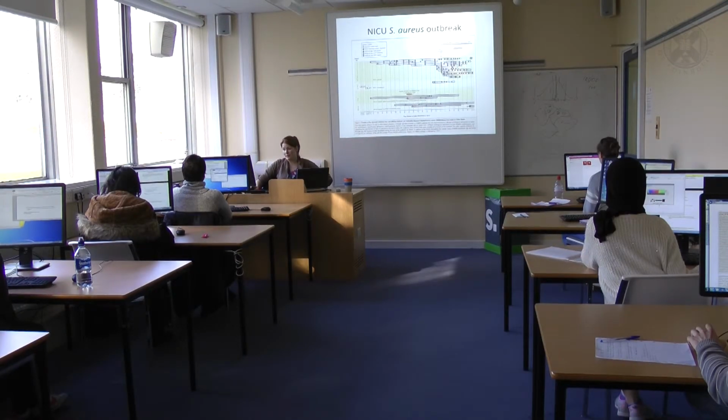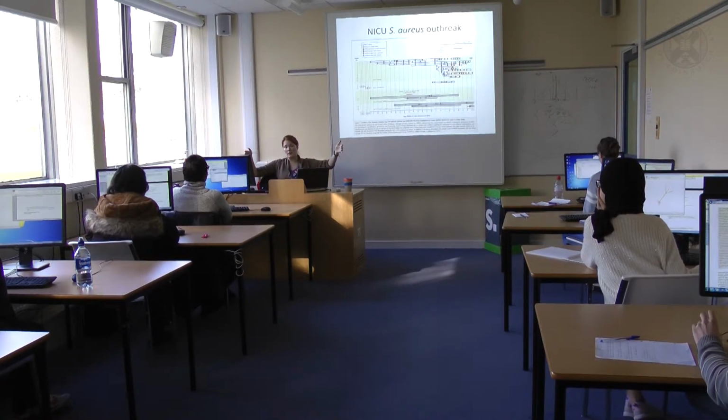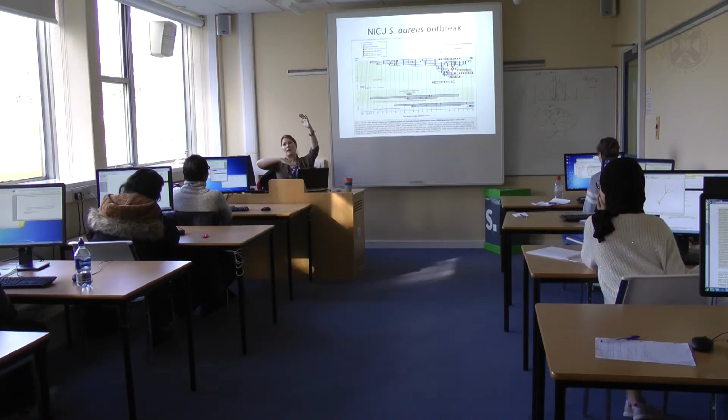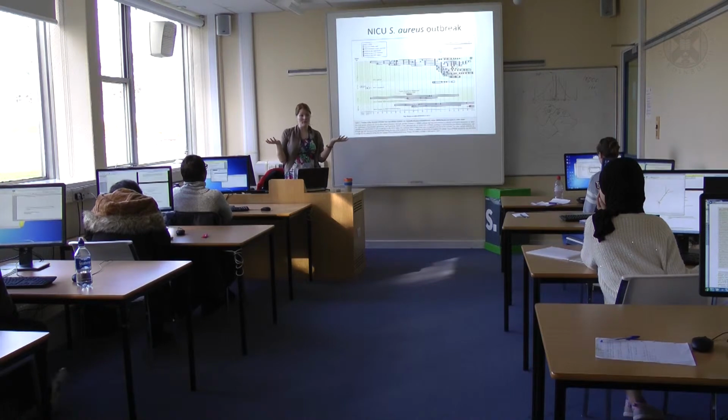Interestingly, one of the other things that they found in this study is, I was saying about the whole genome sequencing, that you align everything to a reference genome. If you think about it, you're not going to get all of the information that way. You can look at what's common to everybody, but if some of the strains that you've sequenced have extra DNA that's not in the reference, then there's nothing for it to align to, if that makes sense.